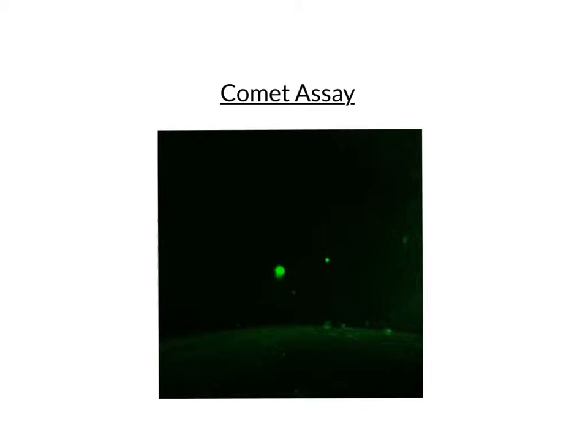The cells were able to be observed through another addition of the DNA dye, and then when it was dry, it went through multiple washes of TBE, chilled lysis solution, and alkaline solution. The gel also went through trips to the fridge and darkness to allow the dye to settle in the gel and also in the cells. After the electrophoresis of the gel, it was observed under the fluorescent microscope to see the distance the DNA traveled in the specific cell.